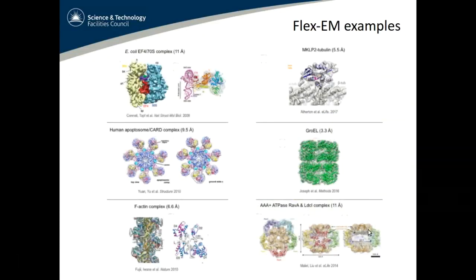This slide is just to show a few examples of where FlexEM has been used to show the range of possible targets. It's quite a range of sizes of complexes and different resolutions. Can be very useful.